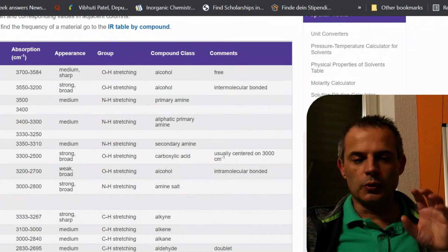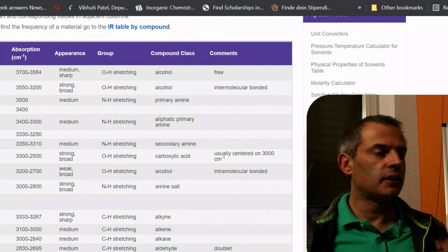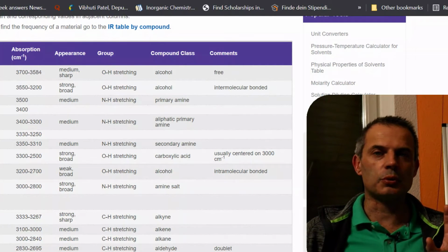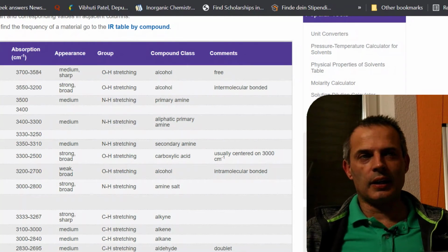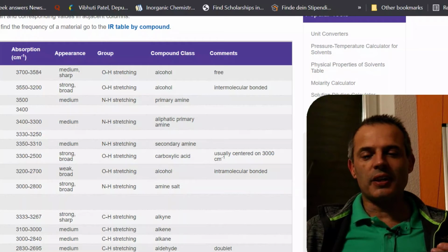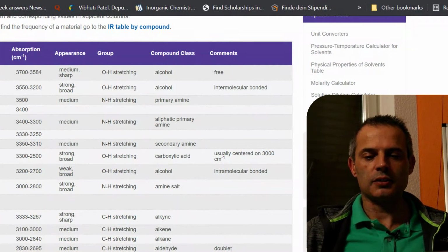Yes. You will notice that we're using a scale for our x-axis here. Although the y-axis is percent absorption, which is comparatively simple to understand, the x-axis is now in per centimeter, which is 1 over the wavelength. So it's effectively wave number. It's 1 over the wavelength, which means that we've got a reciprocal, which means that it's not the same distance between points.